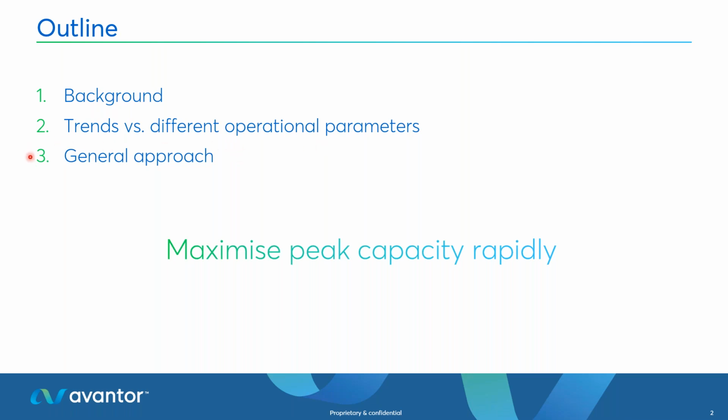And then finally, I'd like to share with you 2 very practical and general approaches that have been published from the group of Professor Peter Carr, one being on the relatively larger peptide complex samples, and then a focus on the small molecules, so a complex small molecule general approach.